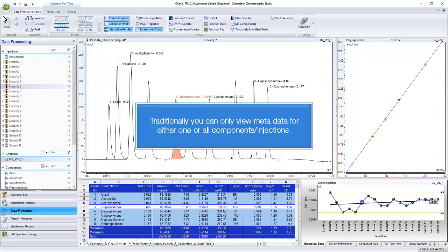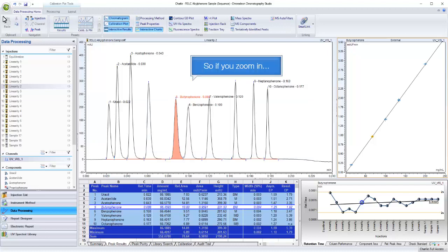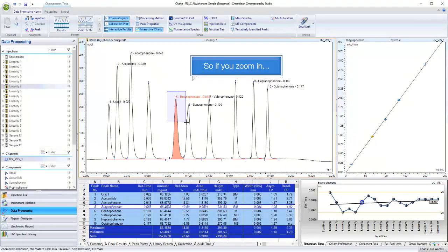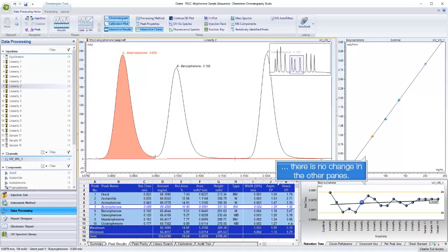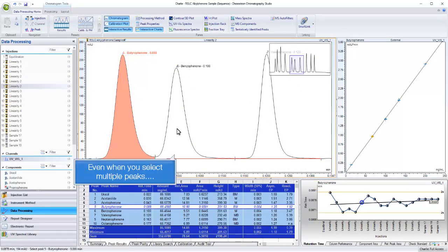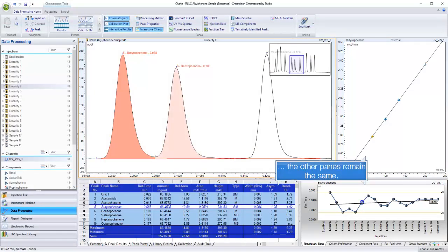Traditionally you can only view metadata for either one or all components or injections. So, if you zoom in, there is no change in the other panes. Even when you select multiple peaks, the other panes remain the same.